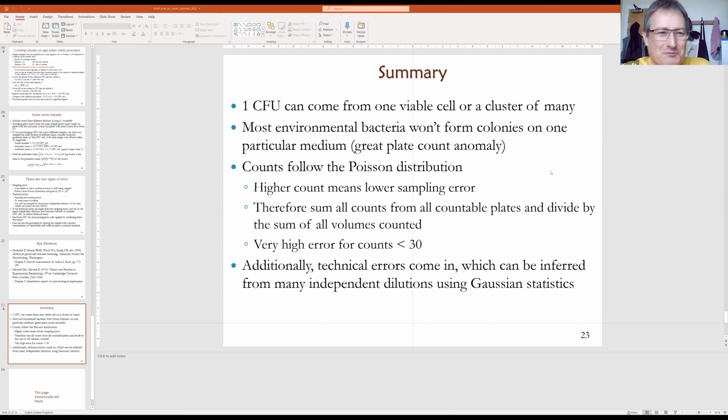the question with many different aspects. So on the positive side, if we are talking about pathogens, they are generally easy to grow on rich media. So in contrast to many environmental bacteria that I've called oligotrophs, so bacteria that are adapted to grow at low nutrient concentrations, this is not your typical pathogen. So the typical pathogen is much easier to count on a plate.